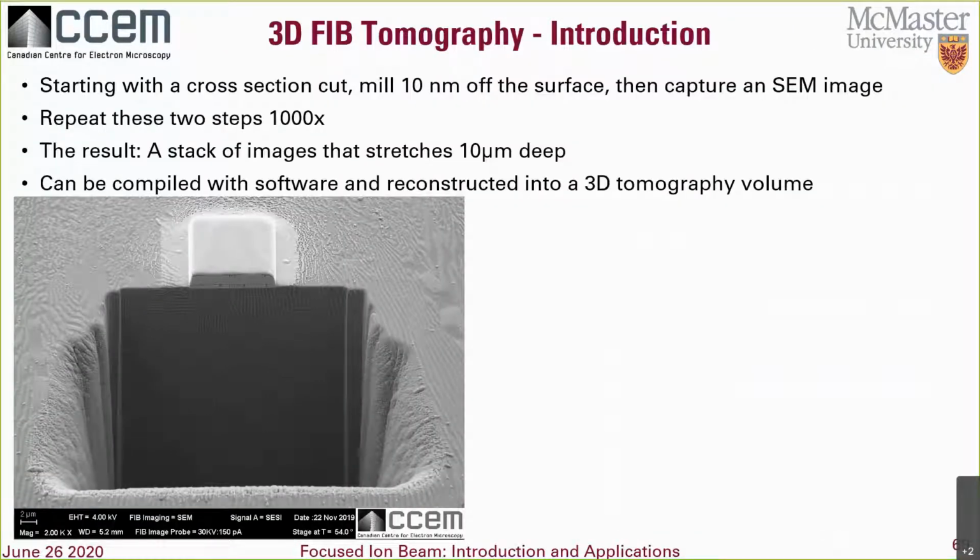The next major application is 3D FIB tomography. Now this could be a whole webinar itself, and it nearly will be, because there are plans for a future webinar on plasma FIB and 3D FIB tomography by Hui Yuan. So I'm just going to introduce the topic here, and I'll be fairly shallow with the details.